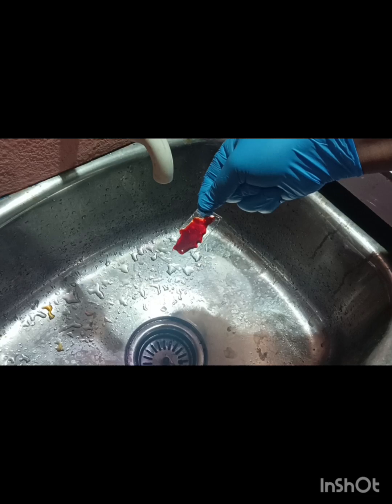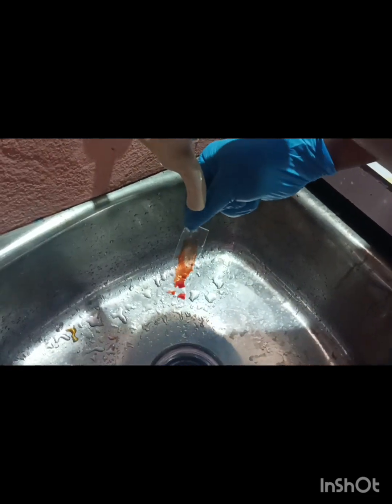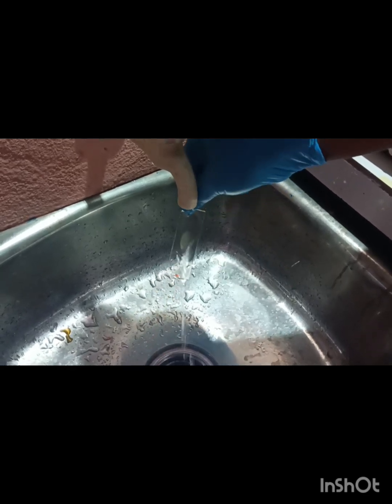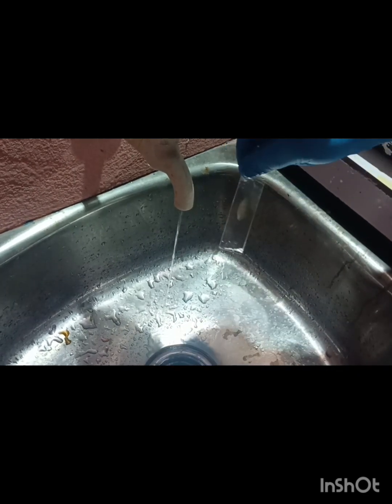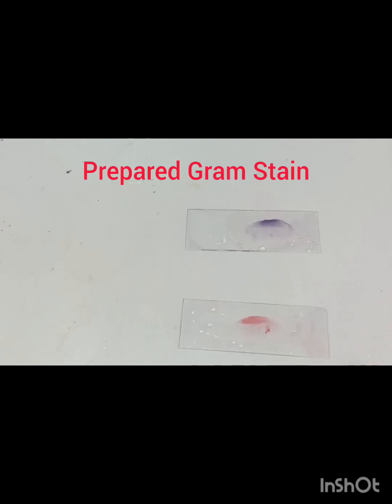After completion of the counterstain, we have to discard it again and wash it properly with tap water like before. And after that, now the gram stain is ready. Now allow it to air dry.